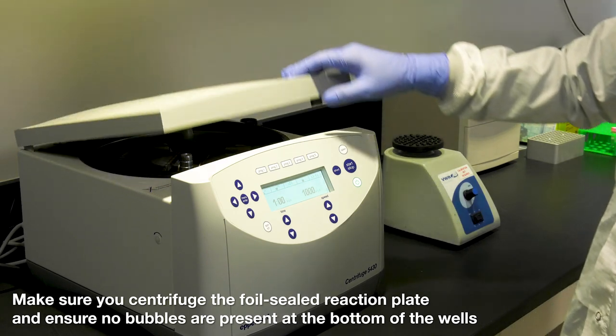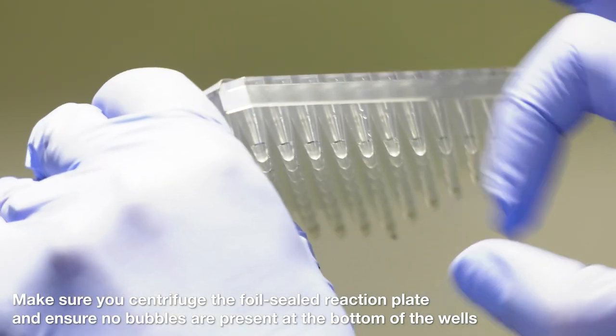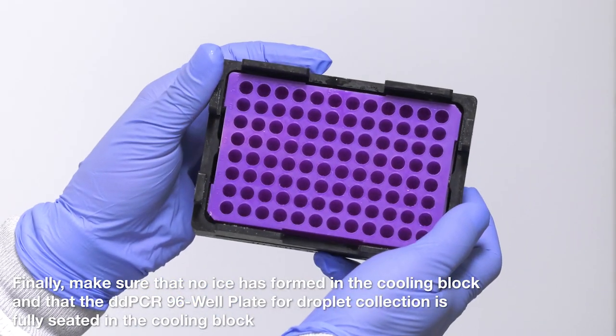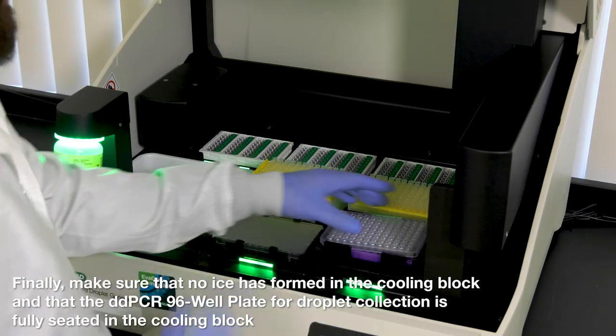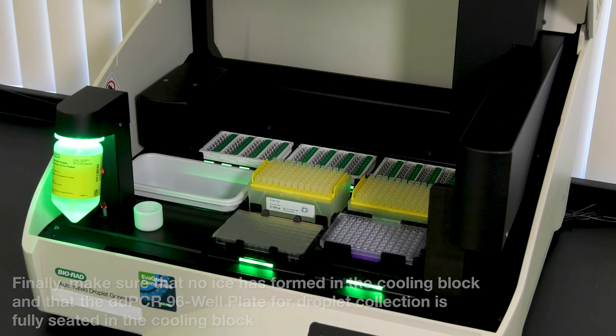Make sure you centrifuge the foil sealed reaction plate and ensure no bubbles are present at the bottom of the wells. Finally, make sure that no ice is formed in the cooling block and that the DD-PCR 96 well plate for droplet collection is fully seated in the cooling block.